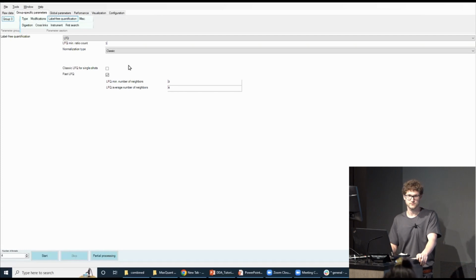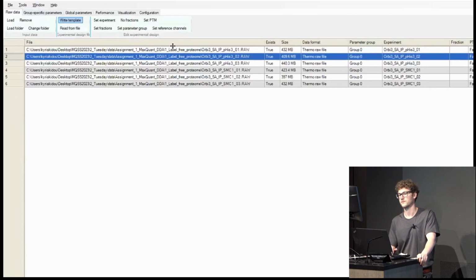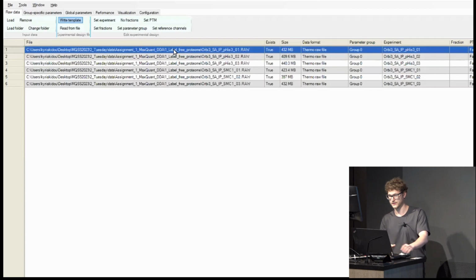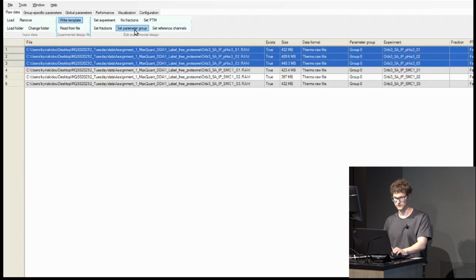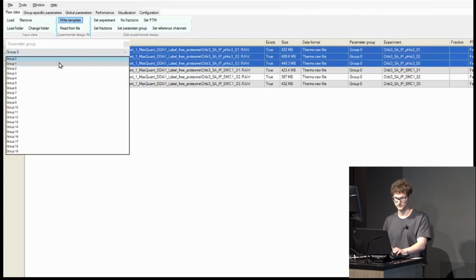So for these experiments, you group 2 conditions, group 1, group 0. I'm wondering how you define a group 0 or group 1 to make multiple groups? So let's say, hypothetically, it's not about this experiment. This experiment was a single group. But let's say I set it to group 1, those 3 files.